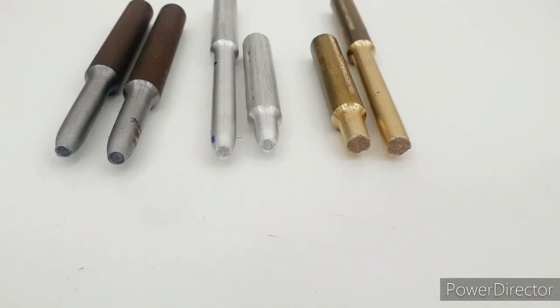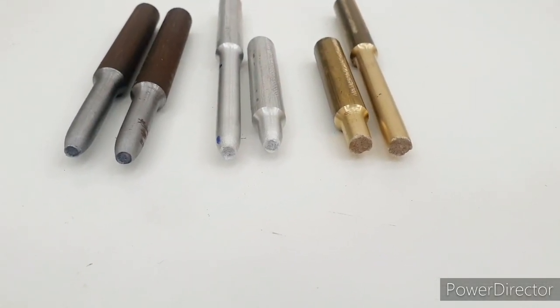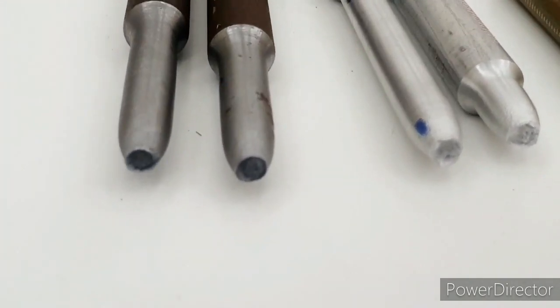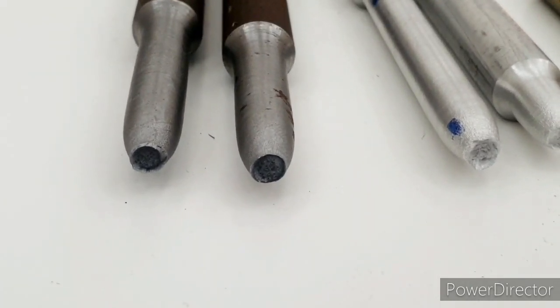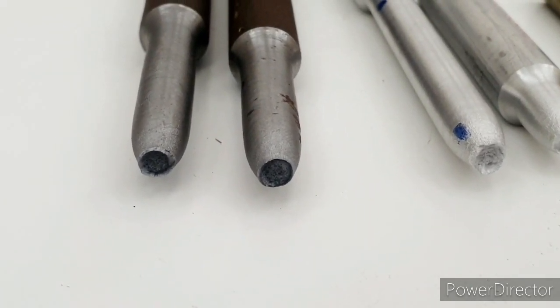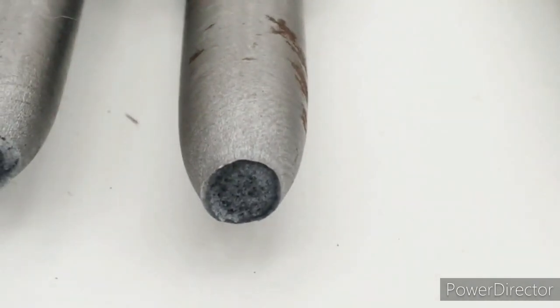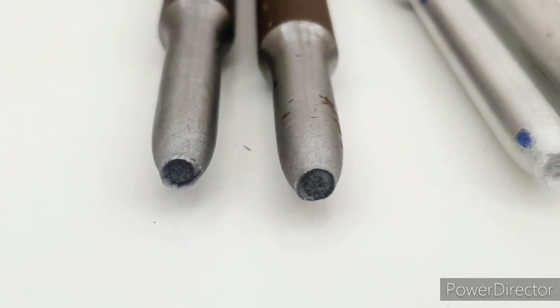It is interesting to look at our final shape of the samples and have a close look at how the failure happened, how the tensile test failure happened. Here we can see this steel sample has a cup-like shape, and there is a noticeable necking happening in the steel sample, and also the grain of this material is visible at this point. This is the steel sample.